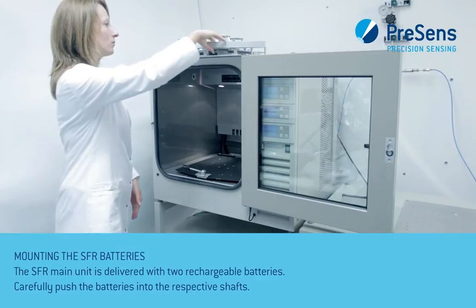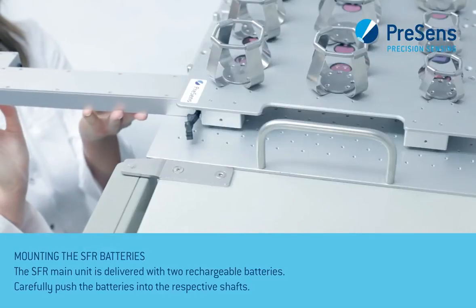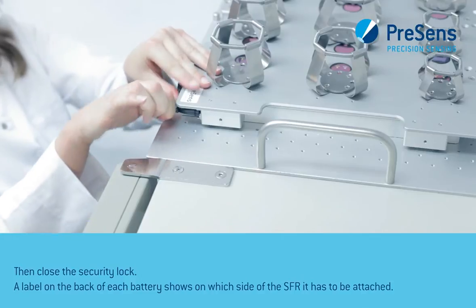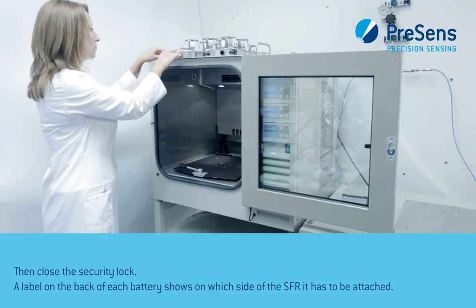The SFR main unit is delivered with two rechargeable batteries. Carefully push the battery into the respective shaft, then close the security lock. A label on the back of each battery shows on which side of the SFR it has to be attached.